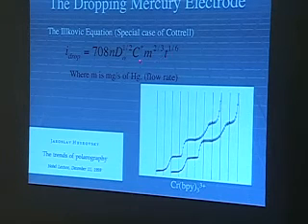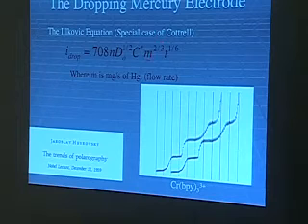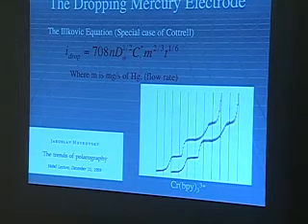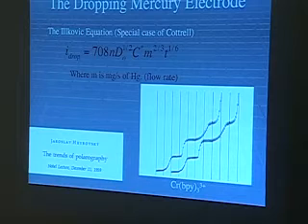Concentration is linear here. This is the flow of mercury in the system. That m is in milligrams per second of mercury flowing through your capillary. So that's where your growth is controlled. And then we have a time dependence, obviously, as that drop goes up.